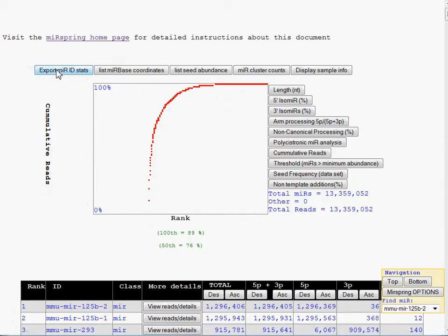Alright, there we go. 3 simple reports that will give you a great way to start some downstream analysis, all in a nice tabulated format.